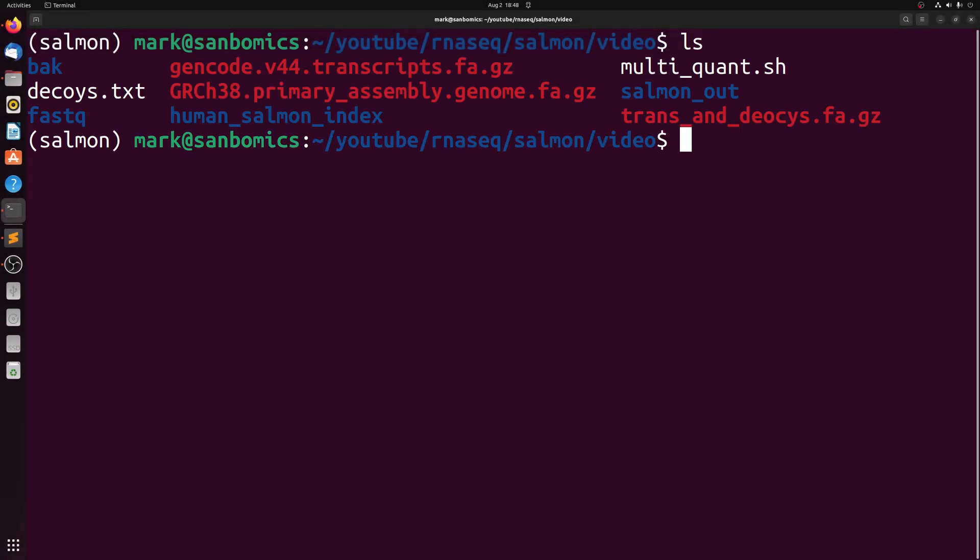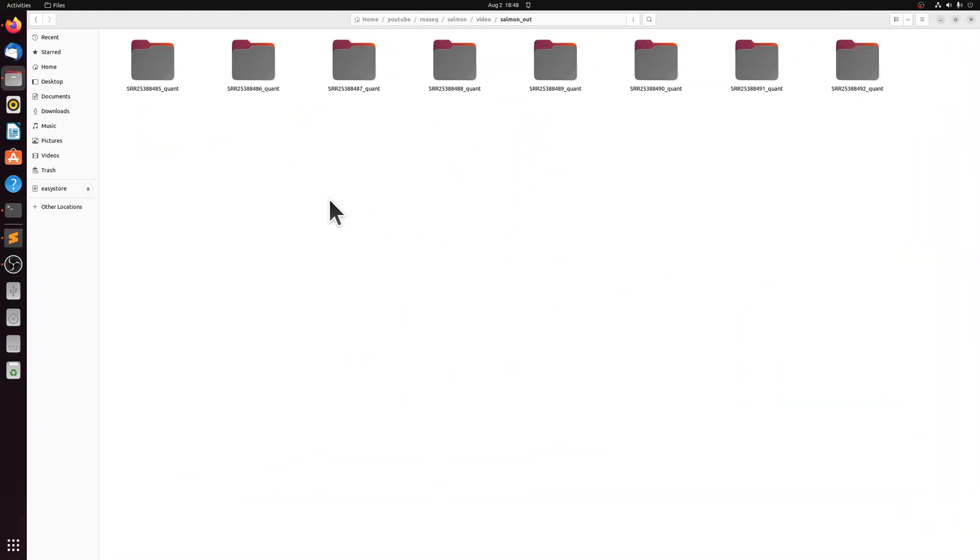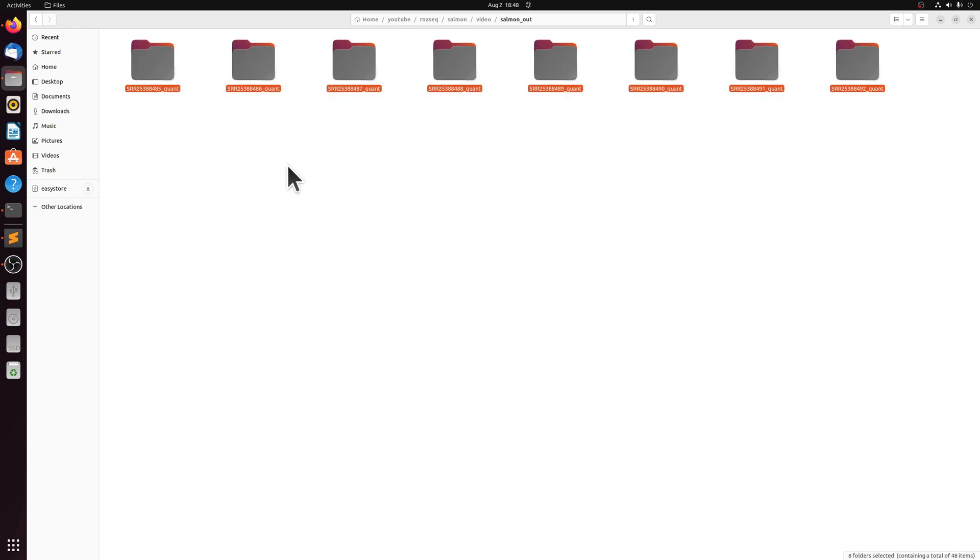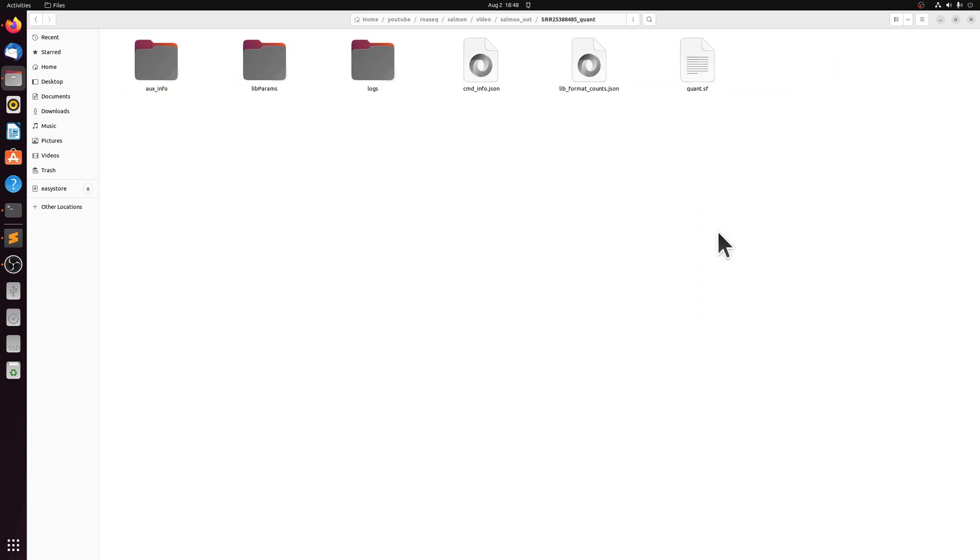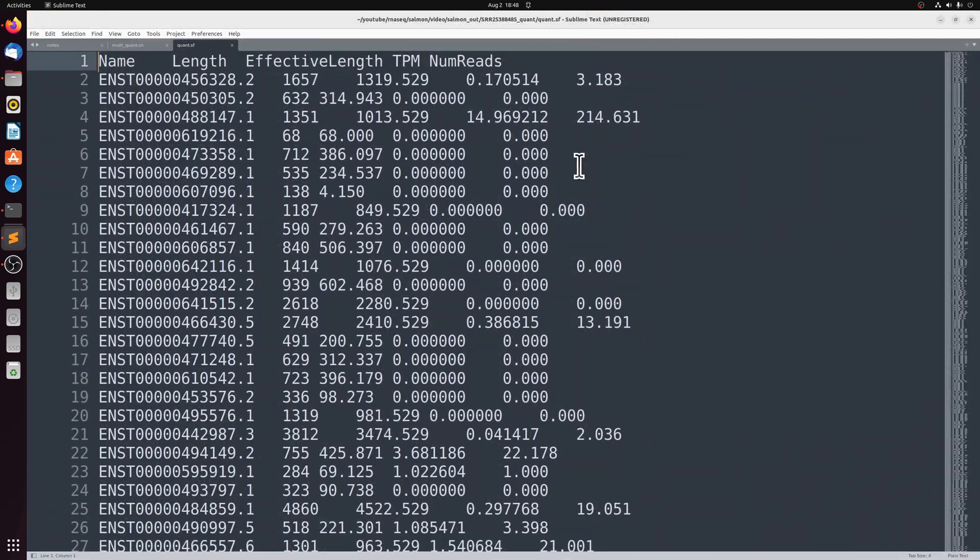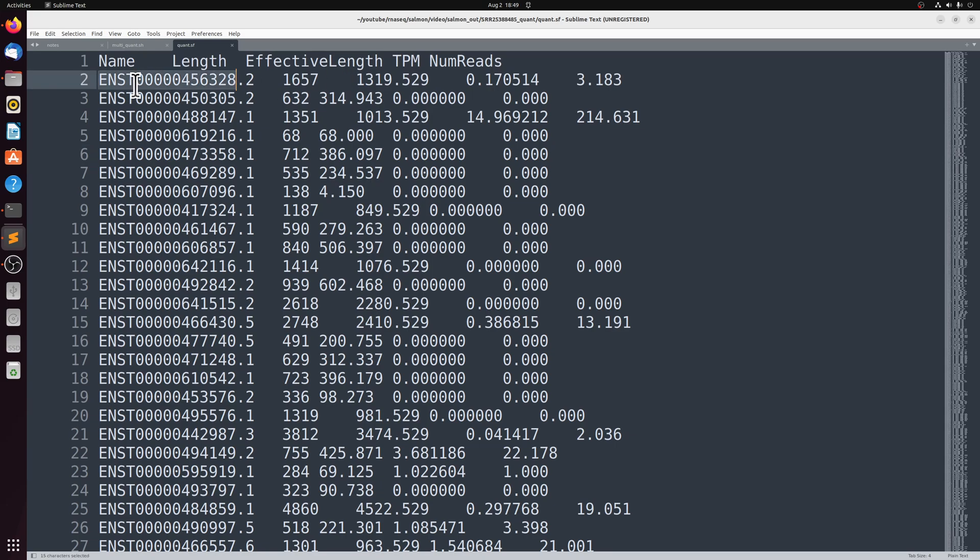So when that finishes, we have our salmon out folder. So we have within our salmon out folder, a sample directory for each of the outputs. And within one of those, the most important file here is going to be this quant.sf file. And that file is just the mapping statistics along with some of the metadata, like the transcript name, its length.